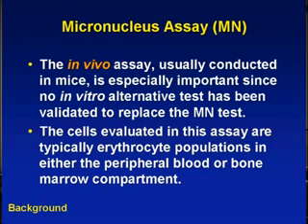It's mostly made by the Litron company just outside our campus. And this is usually conducted in mice because many of the toxicity tests will involve a final stage of any kind of animal. Mice is one of the most popular species. It's especially important because there's no in vitro alternative that can be validated at this moment.